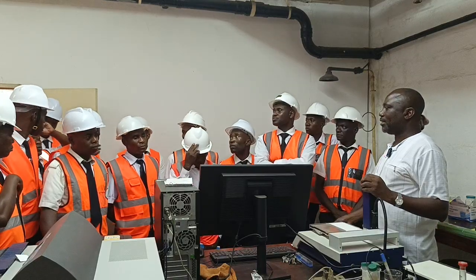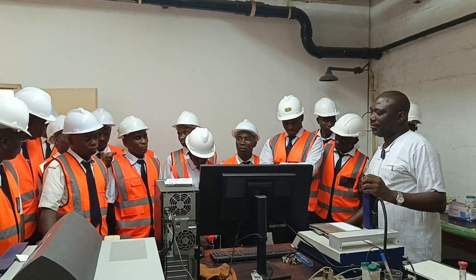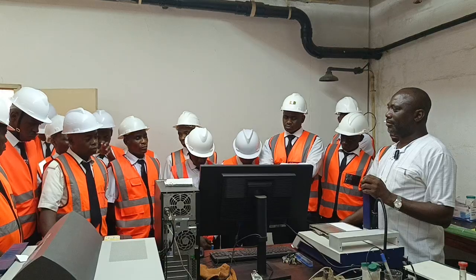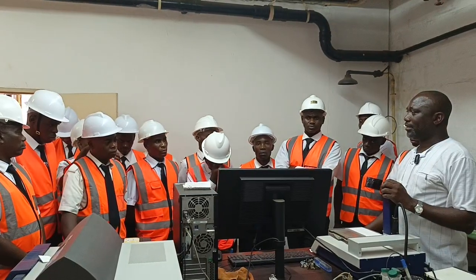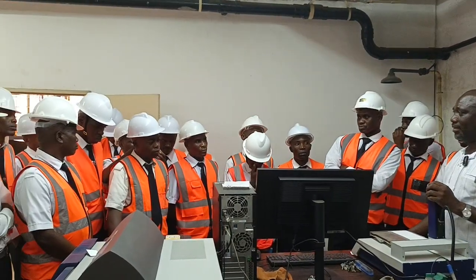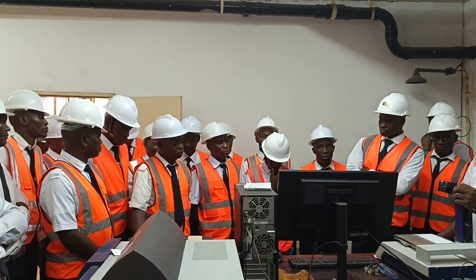Yes. So you said that if you have solid compounds, a mix of solid compounds, you can also analyze it. Yes. As well as a liquid mixture, yes, can also be analyzed. Alright, so meaning a physical or chemical compound can be analyzed. Yes. Alright, thank you, sir.